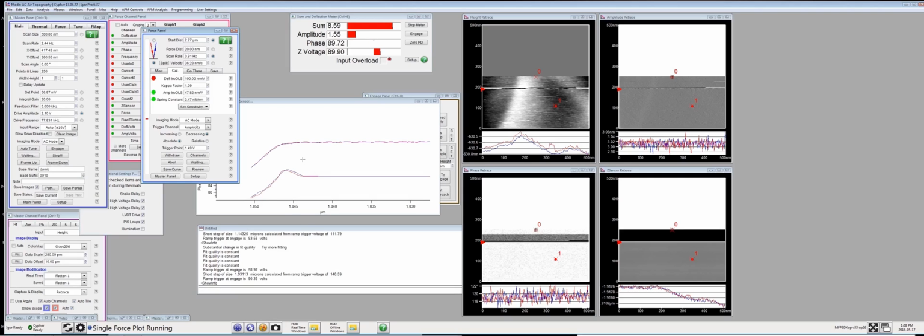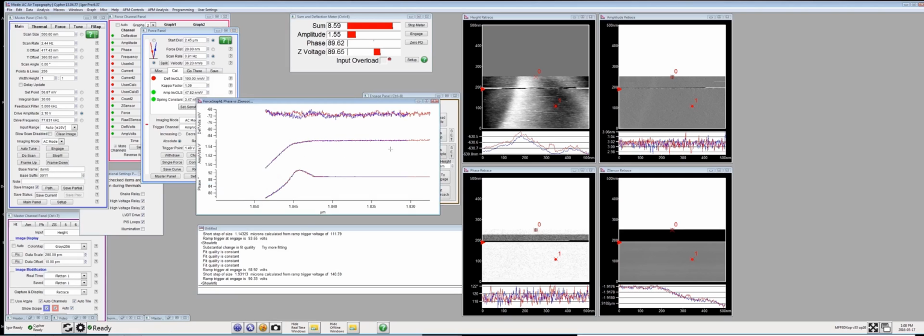So as we can see, the amplitude now is going down and up through the same path. Also the phase is going through the same path, and we get the phase transition from above 90 to below 90 continuously. So there's no abrupt jump or discontinuity, and this is actually the smooth transition we were talking about.